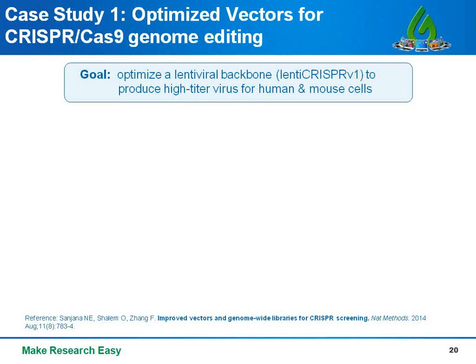This was particularly important because they were using large gRNA libraries, the GeCKO libraries, which have over 100,000 sequences. So they needed high transduction efficiency in order to limit the vast number of cells required for the screen. So their goal was to improve the viral titer. And in order to do that, they made some modifications.